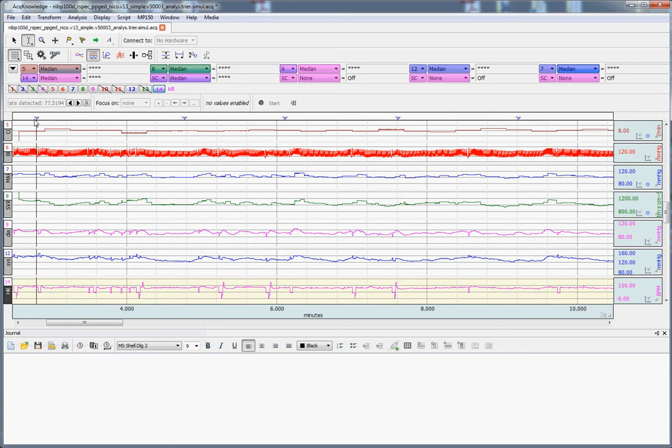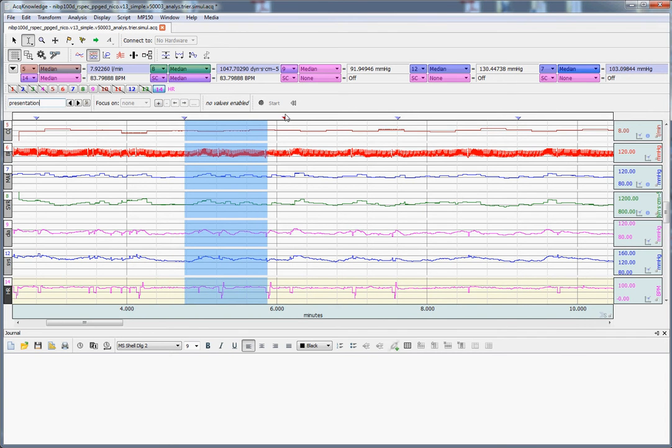And here we have some markers that have been injected during the experiment, either by means of some TTL input, or the experimenter actually pressing some keys on the keyboard like F1, F2. So this is a generic example, but this event could be the marking of the starting of baseline. This is the starting of some different phase in the experiment, and here is yet another phase.